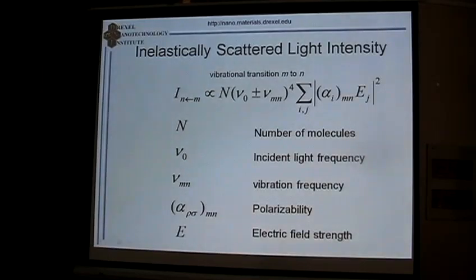In carbon nanotubes, a dark absorbing material, light doesn't go very deep into the sample, so you deal with the surface. You cannot have it cubed by illuminating a larger area. You can have it at maximum squared, going into a larger surface area. But if you want to do analysis on a single carbon nanotube, you cannot increase its volume. You deal with what you have, right? So what else can you do?